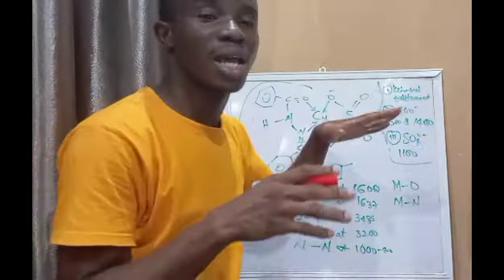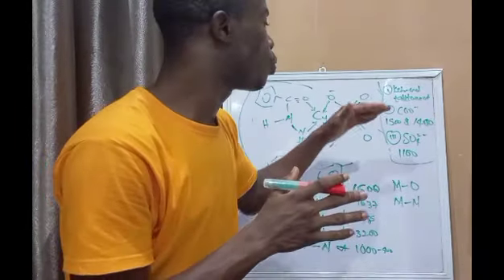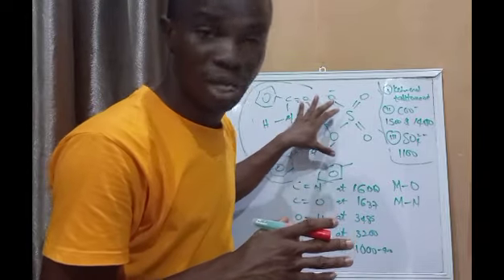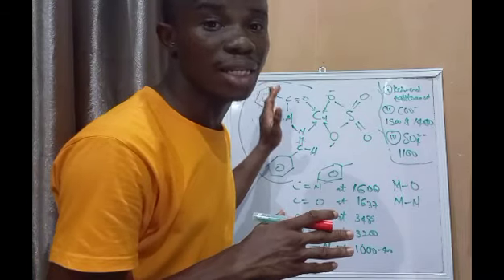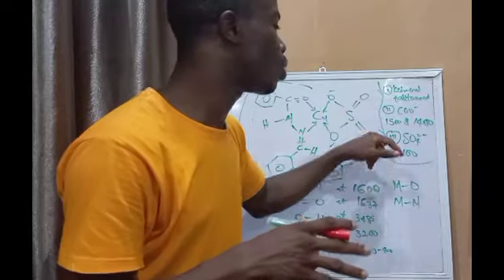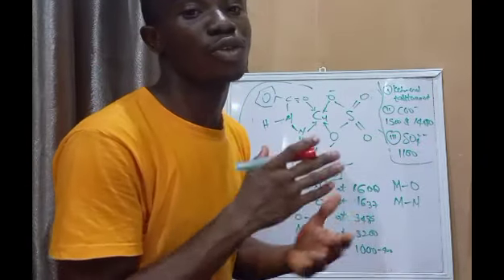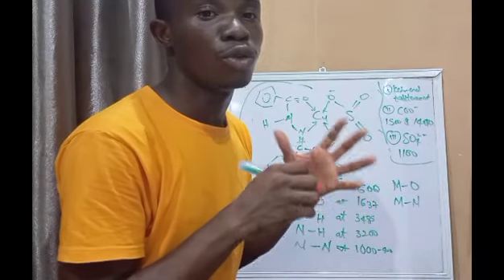But specifically for SO4 2-, the vibrational frequency for when you have SO4 2- being coordinated to a complex that is involving an organic ligand is around 1100. Okay, so you can always look for a signal around 1100 to showcase that you have SO4 2-.